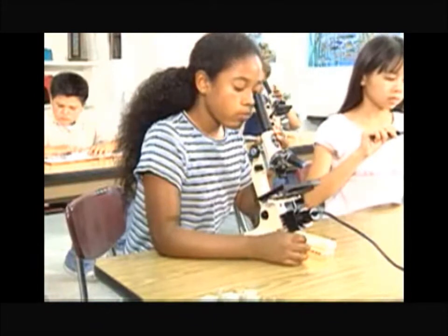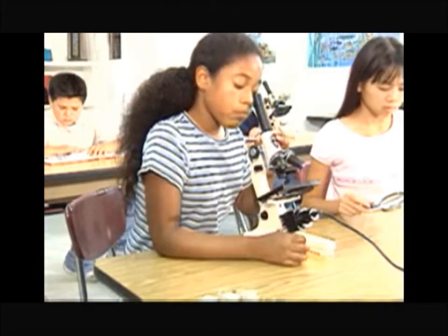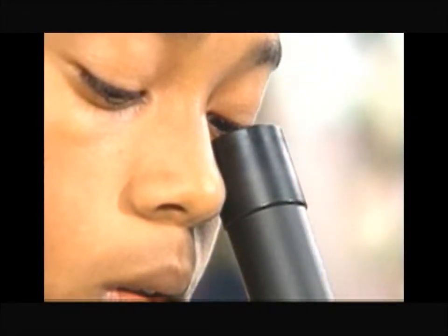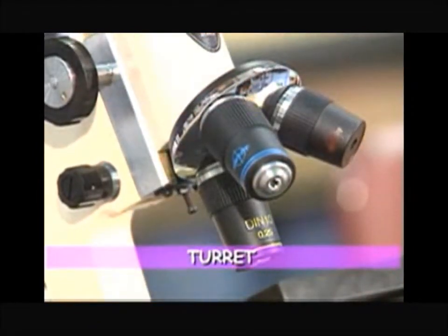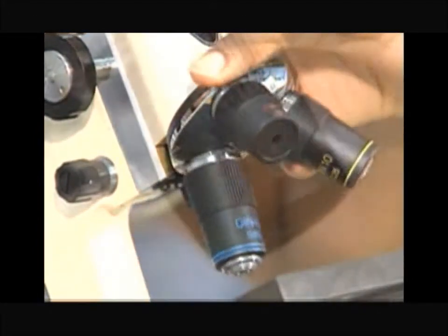As powerful as the stereo microscope is, much more powerful is a standard light microscope. Most student light microscopes usually have a single eyepiece lens. The objective lens is usually located on a rotating turret with several other lenses. Multiple objectives provide a variety of magnifications.